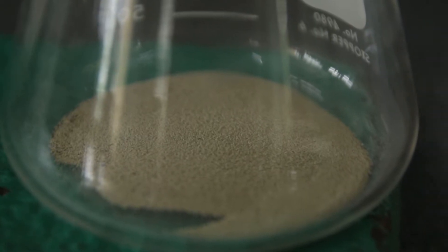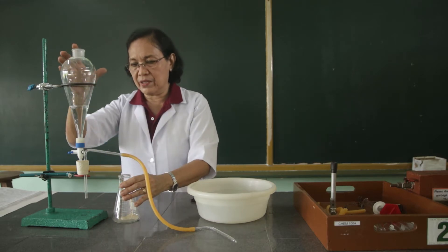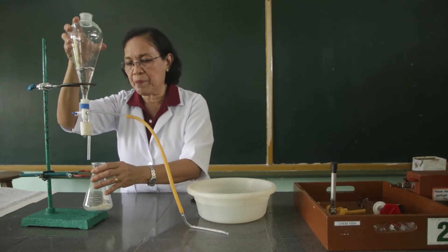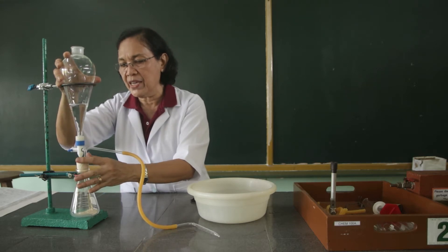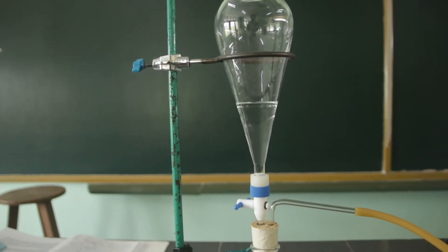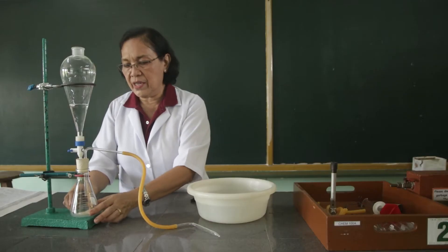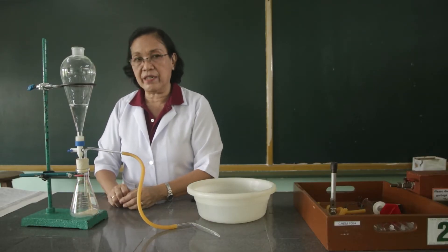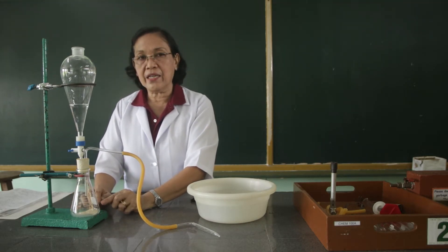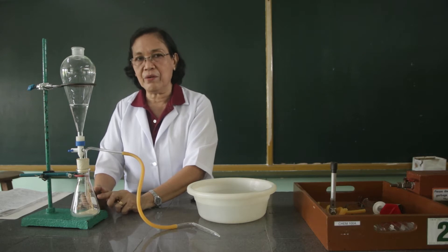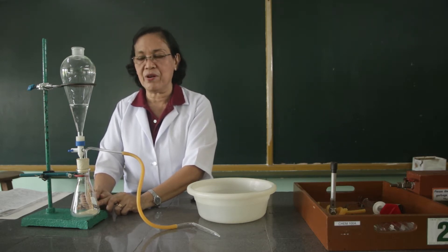And this will be reacted by the water inside the separatory funnel. I am going to insert this separatory funnel into the Erlenmeyer flask so that the water from the separatory funnel will drip down onto the calcium carbide inside the Erlenmeyer flask. The reaction involved is that the calcium carbide plus water will form the acetylene gas plus the calcium hydroxide.